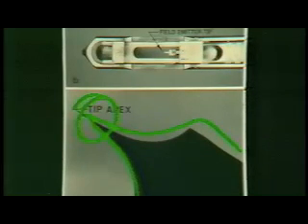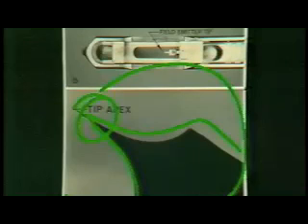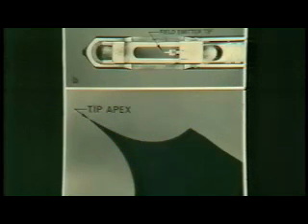And one can, in an optical microscope, look at a picture of what these wires look like, and you see that they actually shape themselves to a very sharp point whose radius of curvature at the apex disappears. Can't see it at the resolution of this microscope.